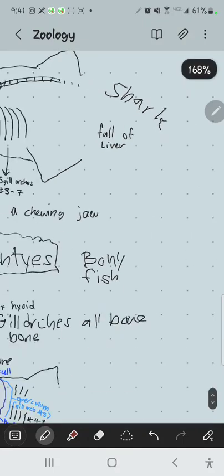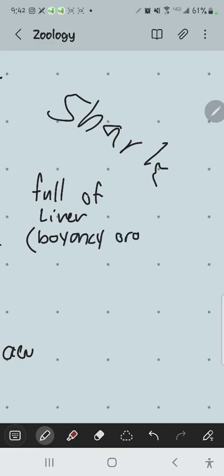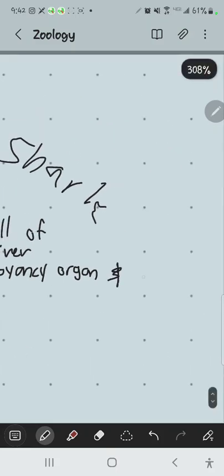So if a shark stops swimming, they sink because they're negatively buoyant. They're heavier than the surrounding water. But the liver, because it makes so much oil and it's kind of spongy, helps them to maybe not sink so fast. So for a shark, the liver kind of is its buoyancy organ. But the main function of the liver we'll talk about here is detoxifying the food they eat. When they eat food that's kind of rotten or maybe poisonous fish or whatever, the liver basically has a huge food nutrient filtering function. It'll detoxify things that come in food, like food poisoning, etc.